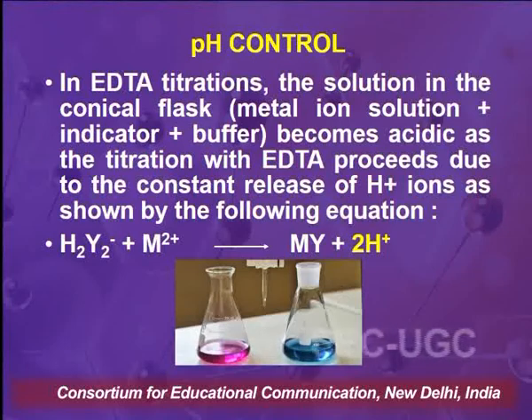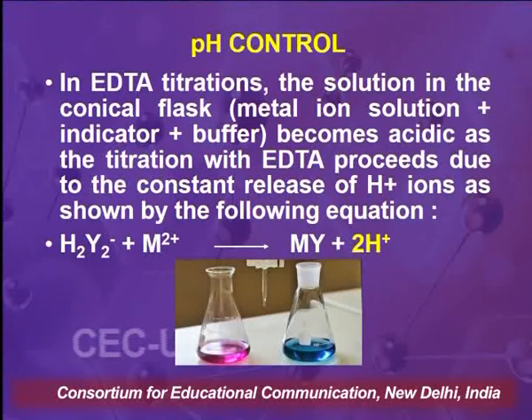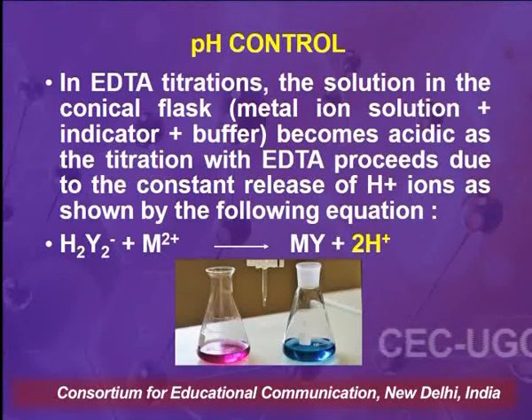The below figure shows us the color changes which occur in the titration of any dipositive metal ion with EDTA using eriochrome black T as the indicator.